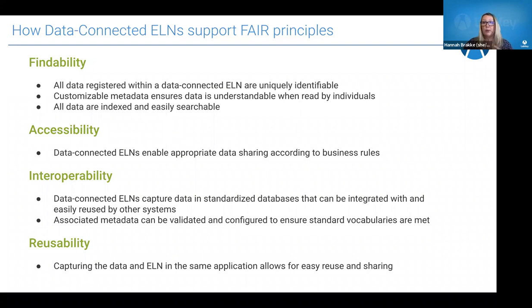When it's interoperable, it also means standardizing to a common language. So if I am searching for mice, we're calling them mice, or something else that we agree to, both in the lab, but then generally in the scientific community, making sure that becomes interoperable between people and labs. And then that reusability component. Data connected ELNs, by snapshotting the data in the ELN, really allow for easy sharing. You can typically share this data out as well if it's in a standardized format in a database.